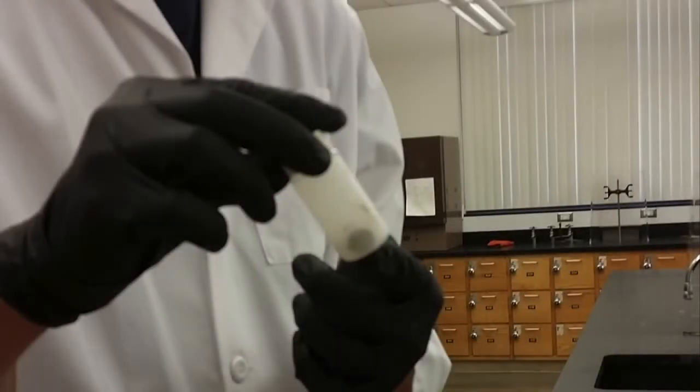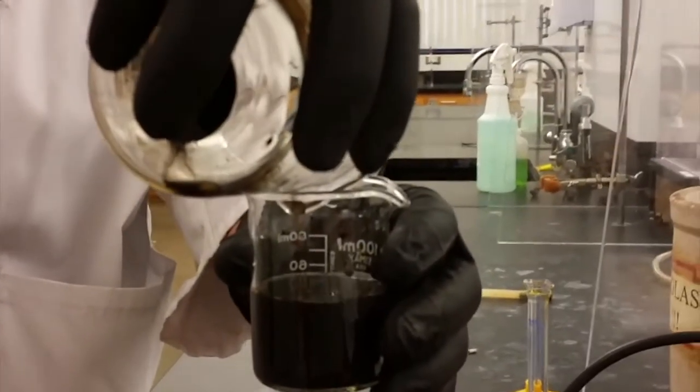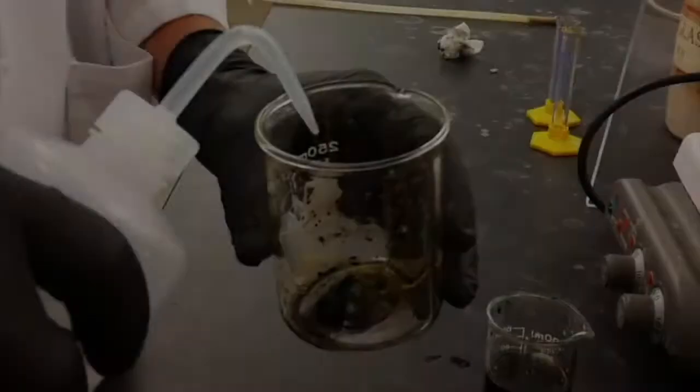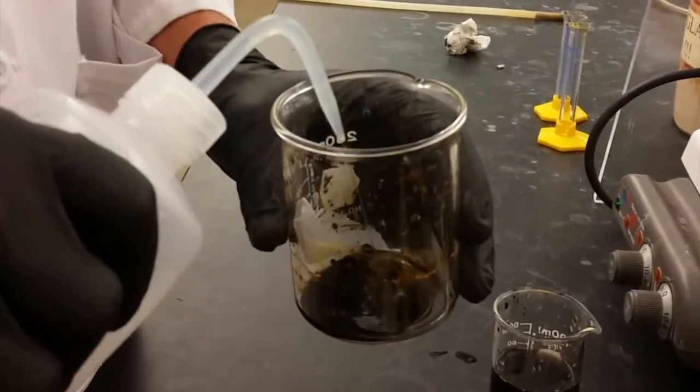For this experiment, you'll need to check out a neodymium magnet from the stock room. One tricky part of the procedure is transferring the ferrofluid from the beaker into the plastic container. You'll use the magnet to help with this process.